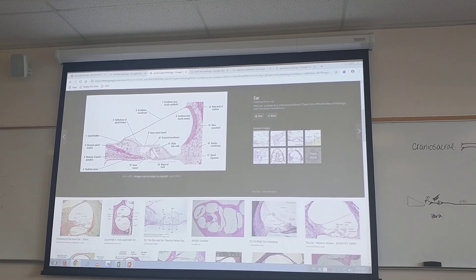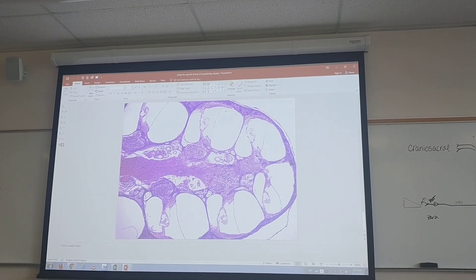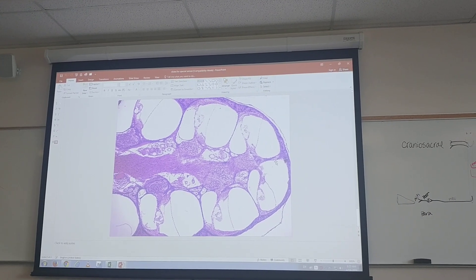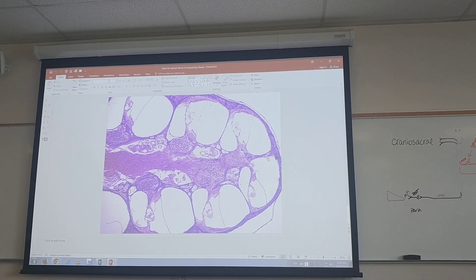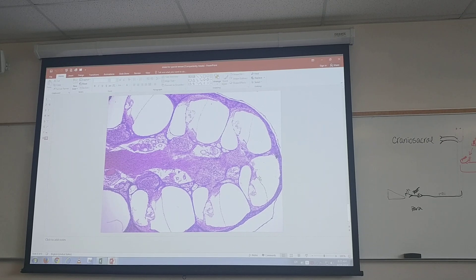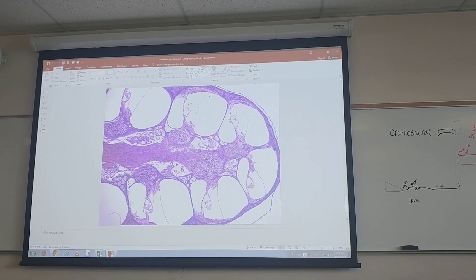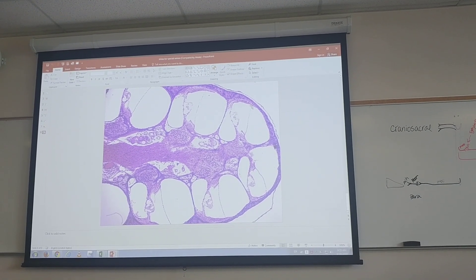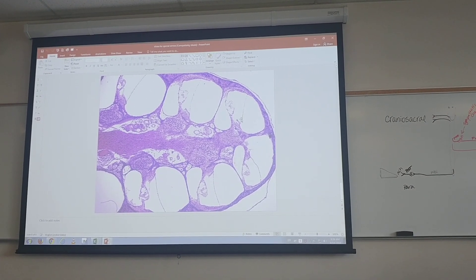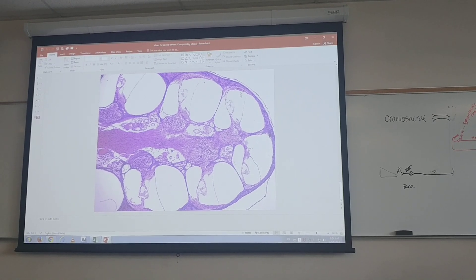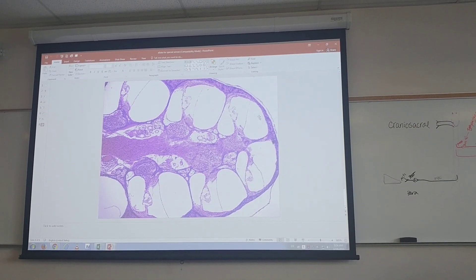Now I'm going to do a quiz. How do I know where I am when looking at a cross-section? What are you going to look for first? You might see the spiral organ — that tells you you have to be in the cochlear duct. You might also want to use the vestibular membrane. So find your spiral organ or vestibular membrane, and that means this has to be the cochlear duct, this has to be the vestibular duct, and this has to be the tympanic.